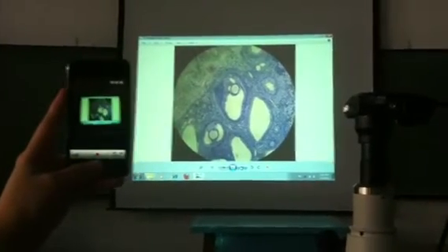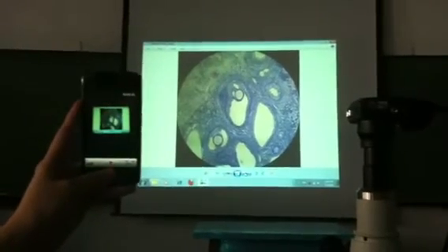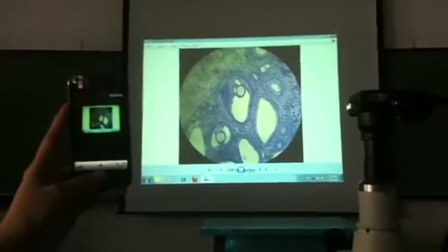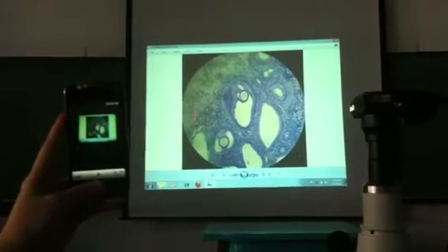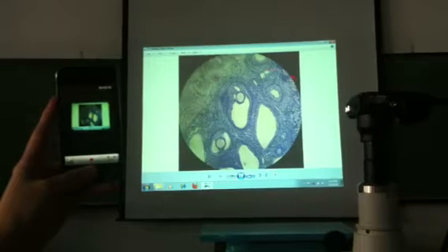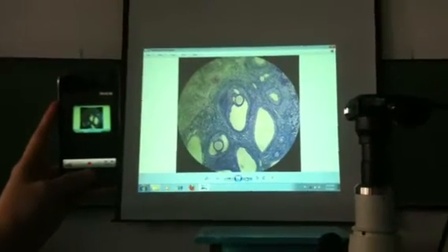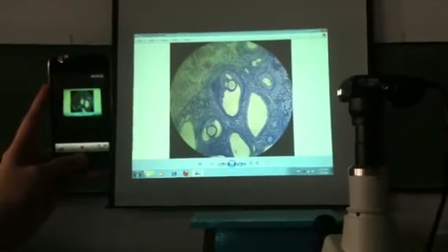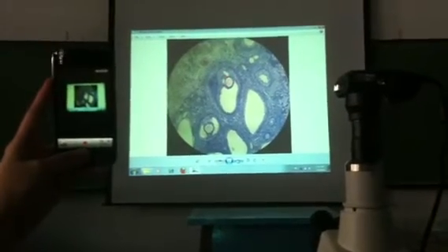The specimen is the ovary. The ovary is an organ. The ovary is not the same as an ovum. We are not asking you to draw the entire ovary, in as much as you are going to draw this again, the entire ovary, during the second cell, when we go to female reproductive system. We are asking you to focus on the ovum, the cell.